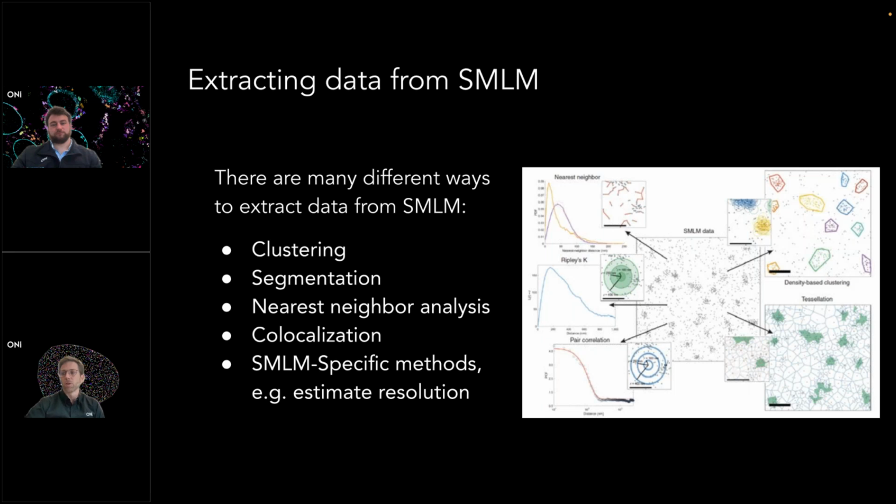Today we're going to focus on clustering because, if you think of the single molecule localization microscopy analysis toolkit, clustering is the first one. Clustering is your hammer. It's the first thing that you're going to use to go in there and say, okay, what can I see in my cells here? What can I see in my fluorescent tags? Clustering is the tool that's going to enable us to see different receptors clustering, for example, or just to identify individual fluorophores on the cover slip.